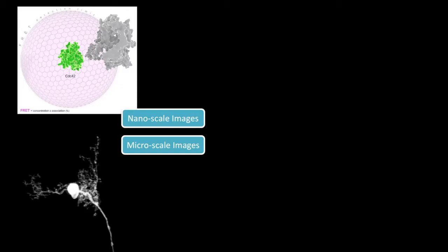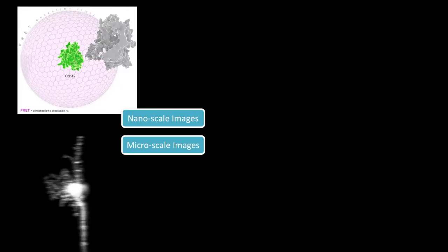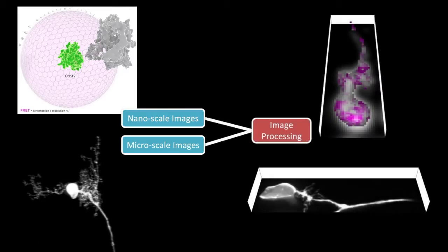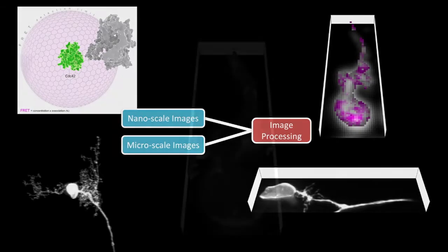Neuroscientists hypothesize that the nanometer-scale protein network and micrometer-scale cellular complexity are linked with each other. Our method can be applied to the quantitative analysis for the study of this relationship between these two worlds. In this work, we map the concentration map of the protein-protein interaction in low spatial resolution to the high spatial resolution GFP image. Aligning these two modalities provides the information about the protein interaction at the level of branching details. It enables the local analysis of both dendritic complexity and neuronal functionality altogether.